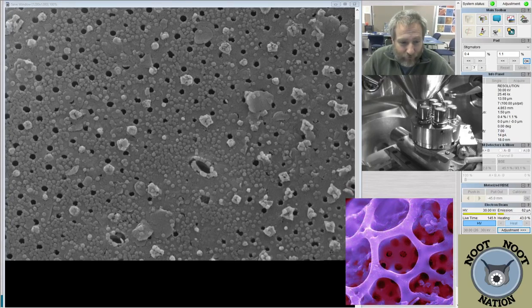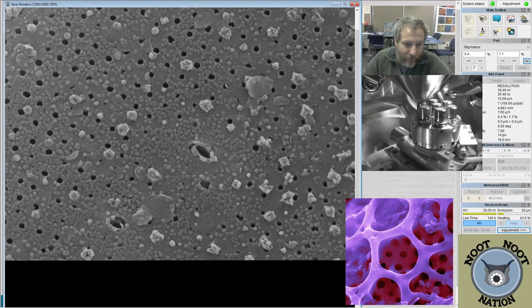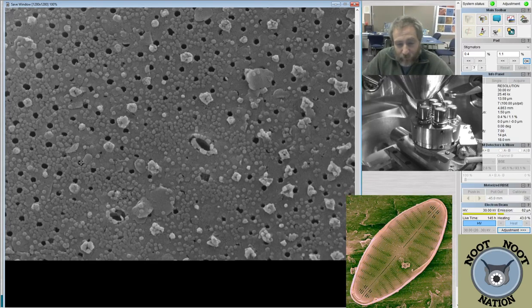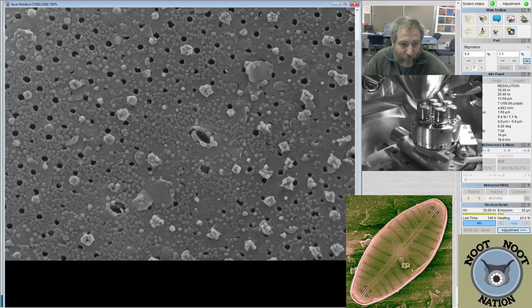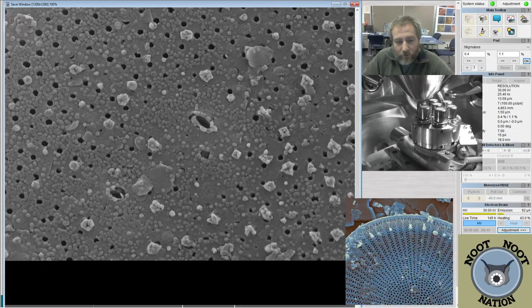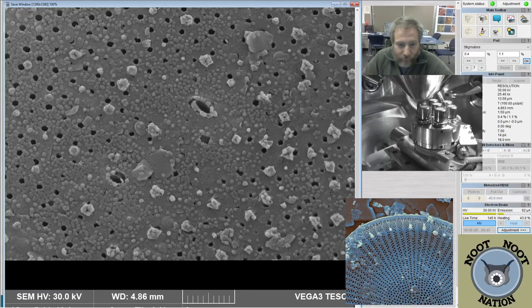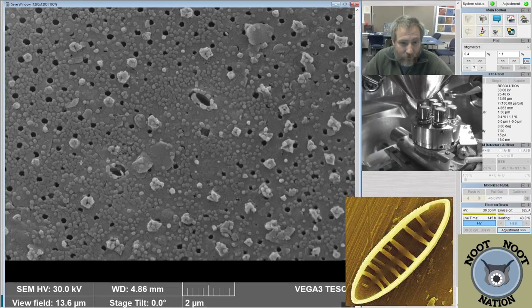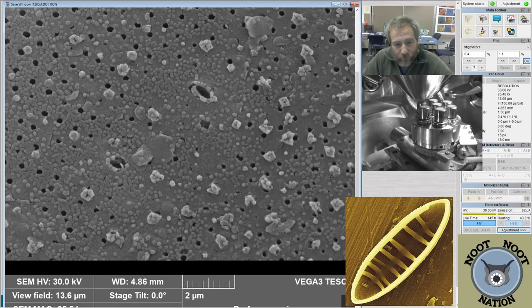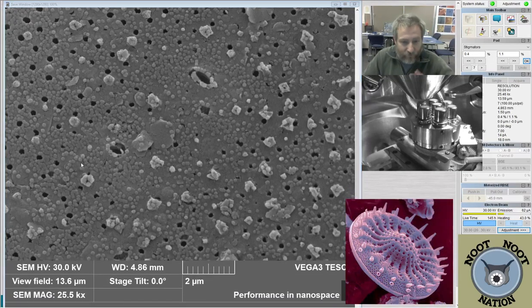That's actually similar to my entire research approach, which is that every time I start on a new project, I don't know what diatoms will be in the samples, and there's a pretty good chance that I've never seen half or more of those diatoms at the species level, which means my job's always changing. It's always got some new, interesting element to it where I have to figure out species and in some ways start over. I have a lot of experience identifying diatoms, so it's not completely new to me, but if you've never seen a species before, you can't immediately identify it. So it requires a bit of detective work, which is nice. I actually really like that aspect of my job.